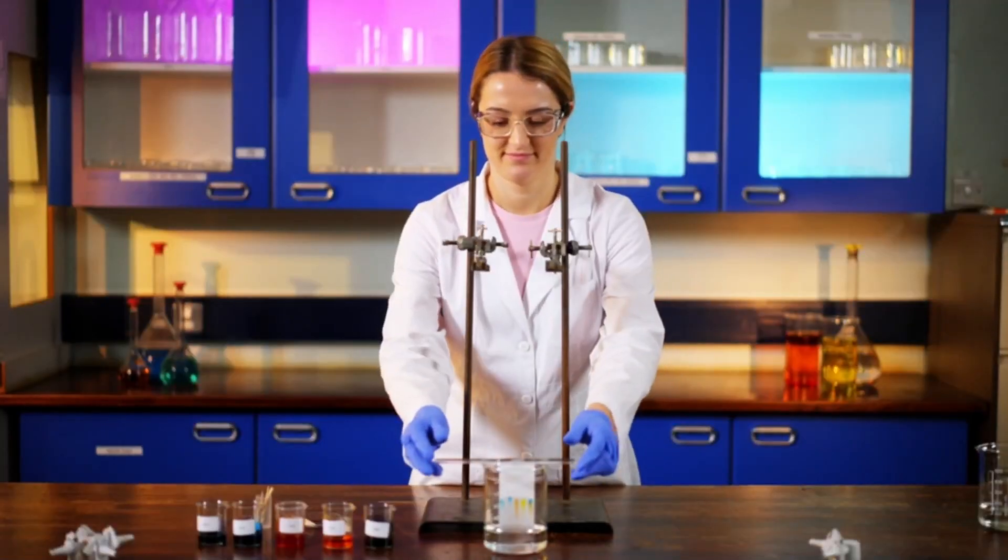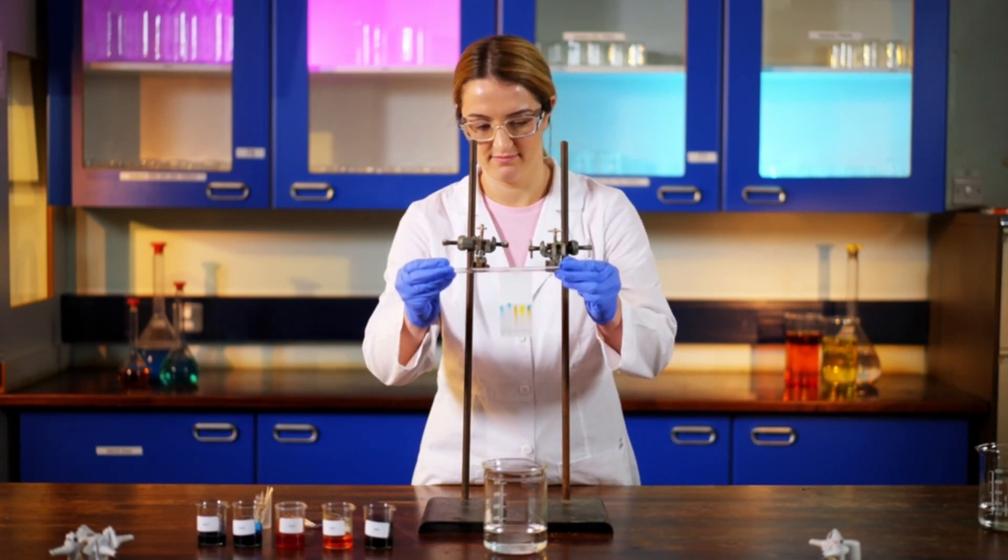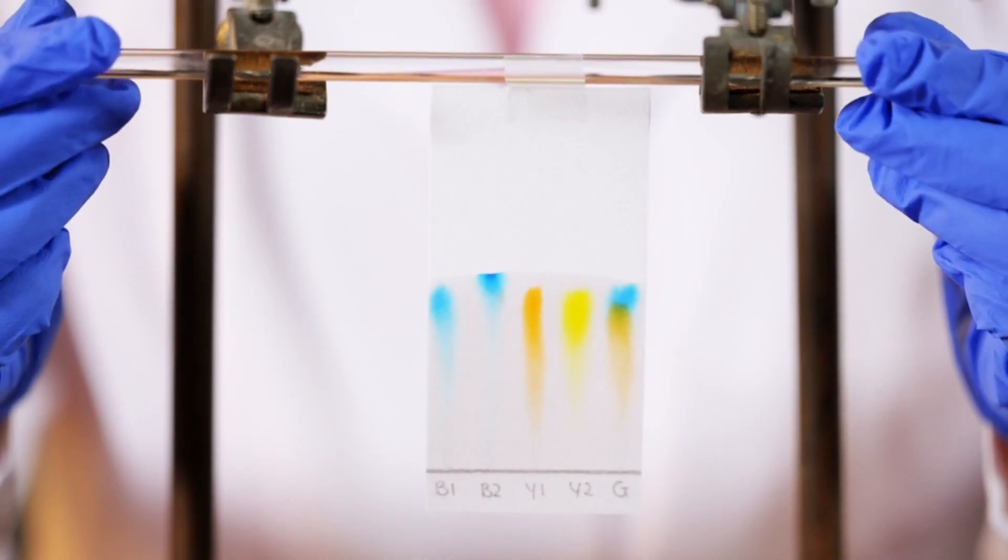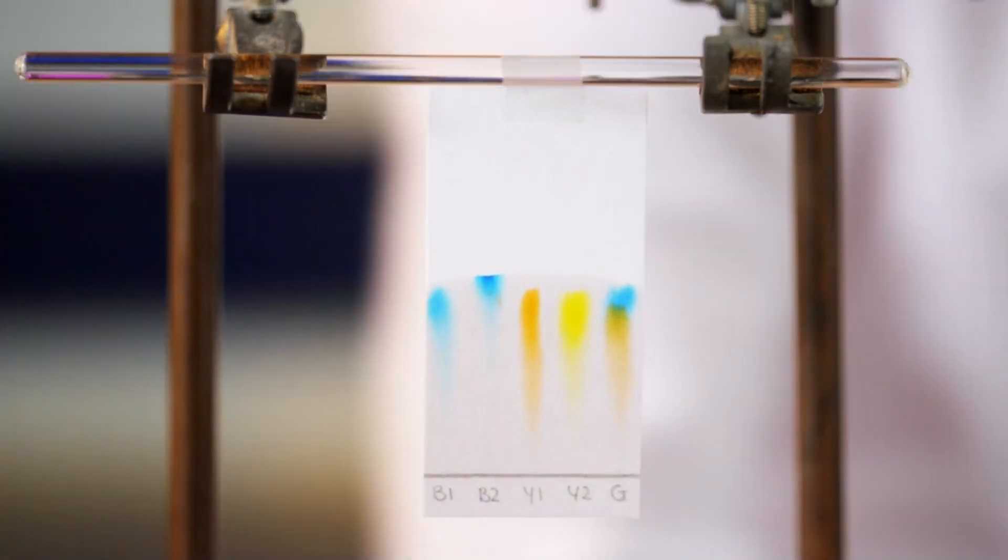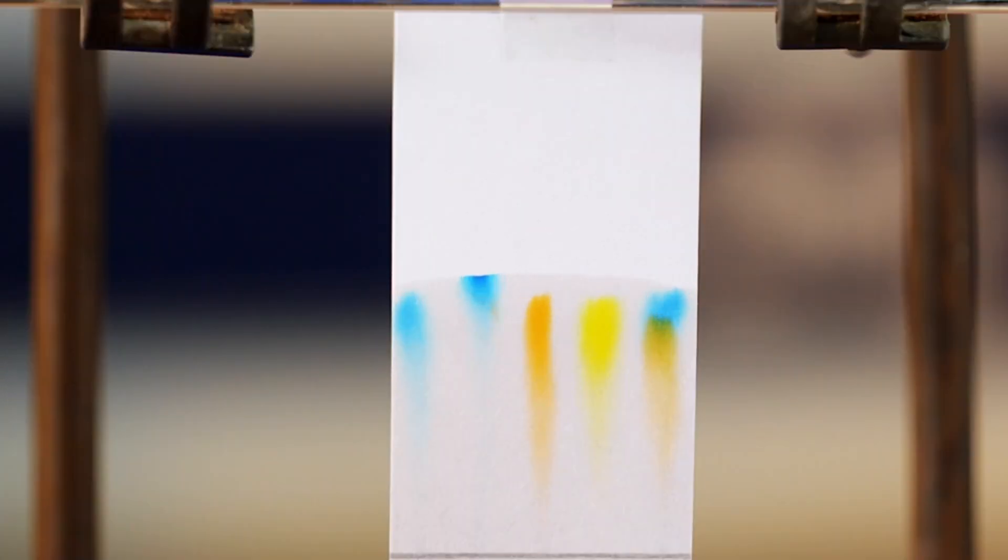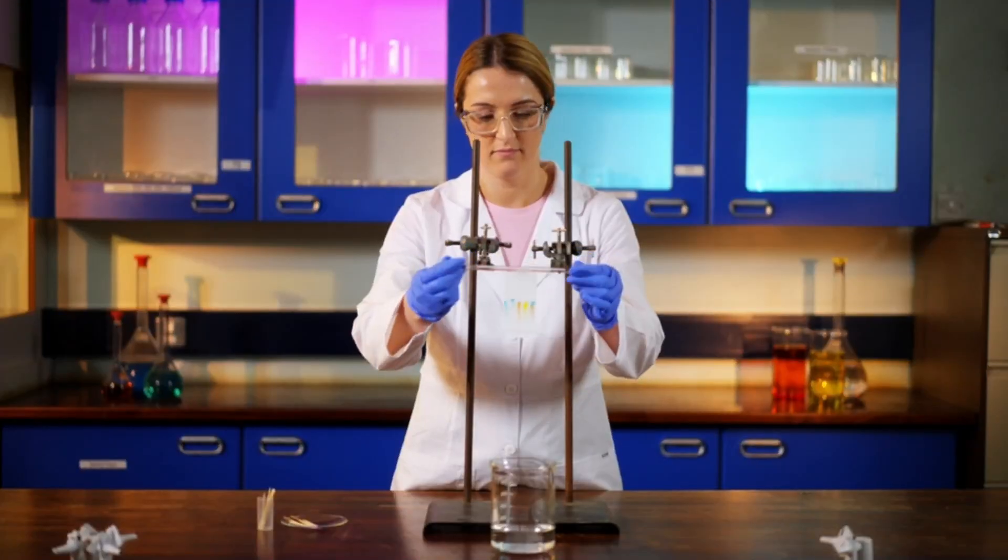Once the water has stopped rising, you can carefully remove it from the beaker. You can see that the food colorings have separated out to form a pattern called a chromatogram. The chromatogram shows us the number of pigments each food coloring contains.